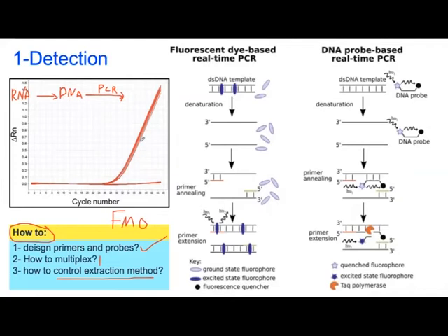But in some fields, especially like in corona, when you have a disease, it's very important. Sometimes you're going to get a negative reaction, and it has 2 meanings. Either the patient does not have the virus or the bacteria, or maybe your PCR and your reverse transcription did not work perfectly. And this is dangerous if you have a patient who has the disease, but you tell him that he does not have the disease from the RT-PCR.